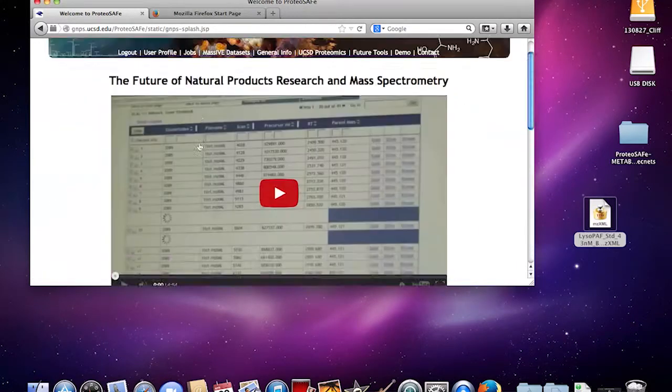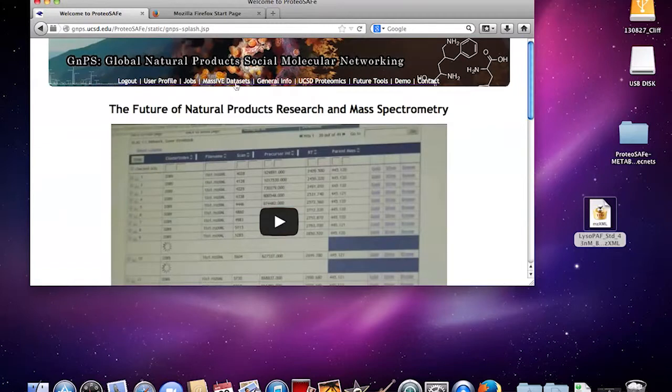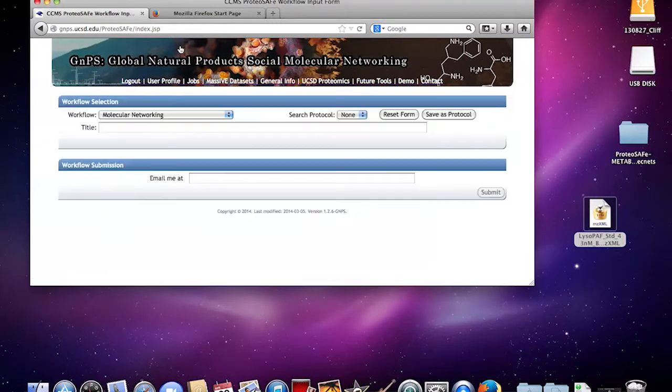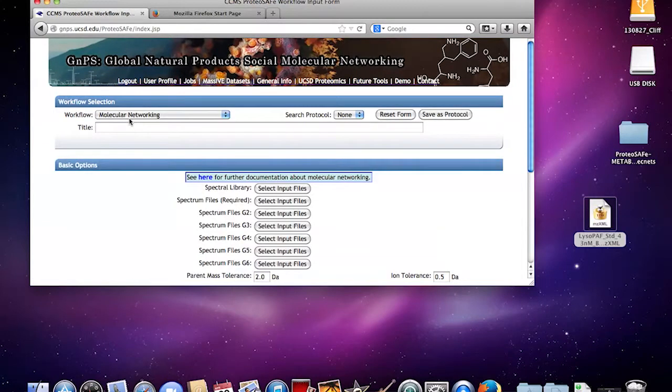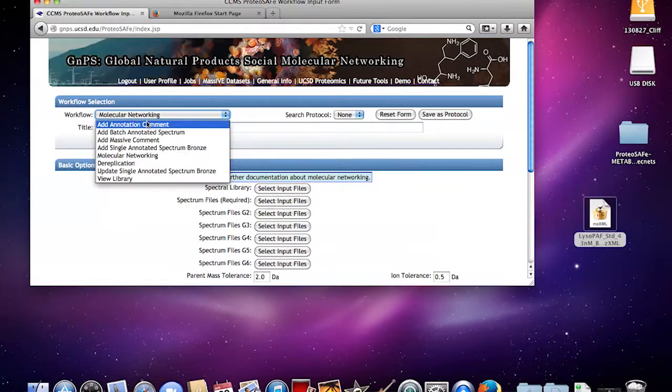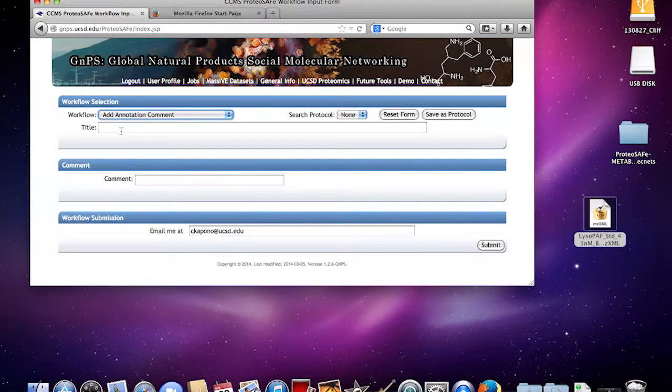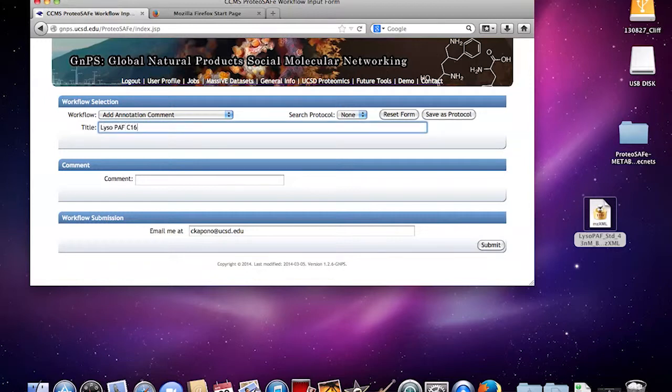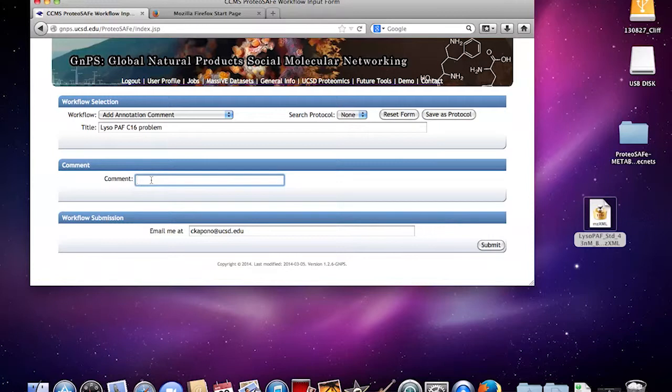If there are any problems that you see with your upload, you can add annotation comments. You can call this something like Lyso PAF C16 problem.